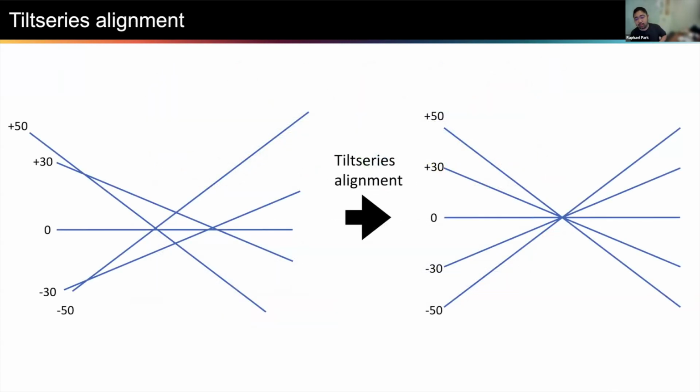So once you collect this type of tilt series, like I mentioned, we have to align the tilt series. This is because, of course, it'd be wonderful if the stage were entirely stable, so that as you tilt, you're perfectly collecting images on the same area. But in reality, that's not true. Because of this imperfection, the type of image you have is like what I have illustrated on the left. So your images are sort of all over the place at different angles.